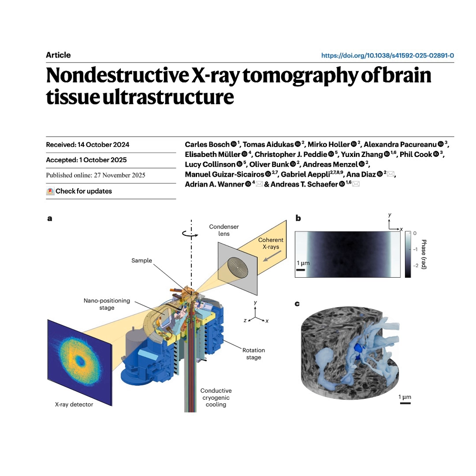And the result? How much better was this new tough resin? The results were night and day. Where standard EPON failed completely, the TGPAP sample showed almost no mass loss. None. Practically none. Just some microscopic localized defects, even when the dose went way beyond 10 to the 9th gray. It held its structure even up to doses over 10 to the 10th gray. That is a massive, massive leap.